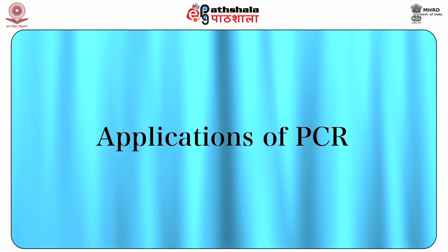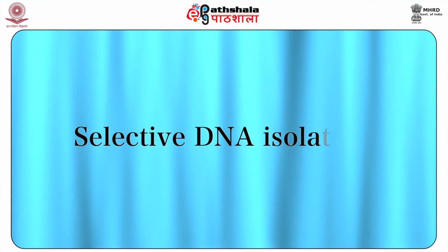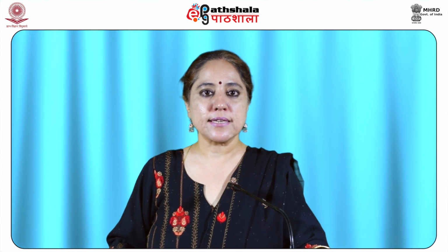Students, let us now study the various applications of PCR. First, selective DNA isolation. PCR is used to separate DNA fragments from genomic DNA or RNA by selectively amplifying specific regions.